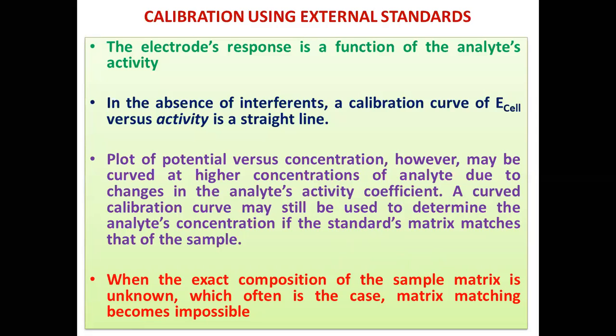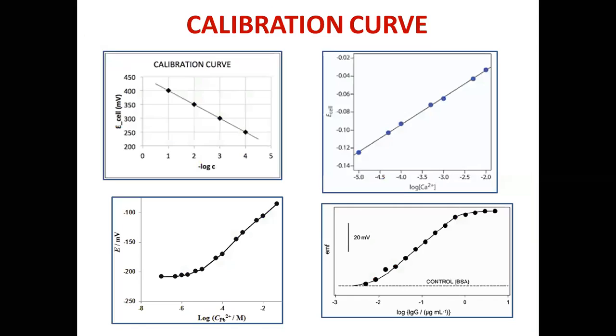What do you do in spectrophotometry? You prepare standard solutions of known concentration. You measure the absorbance for each. Then you plot a graph of absorbance versus concentration. That will be a straight line. That is called the calibration line.